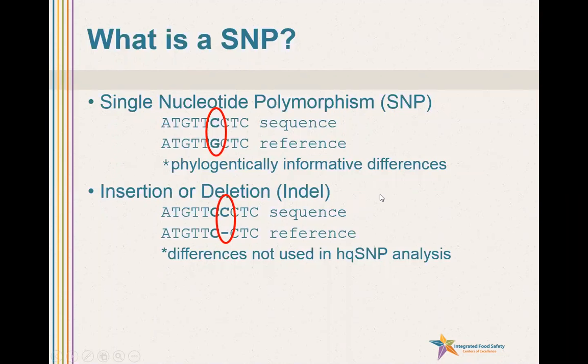But as we try to use whole genome sequence data, so long stretches of these nucleotides, ranging from a few thousand for total viral genomes to millions and beyond for bacterial and fungal genomes, we really need to look a little bit deeper in terms of what the different mechanisms are, how organisms can become different.